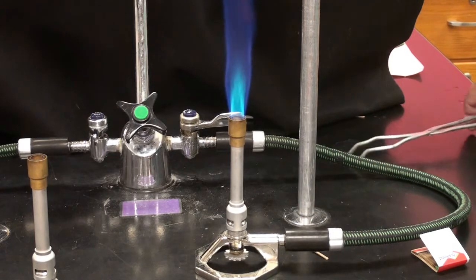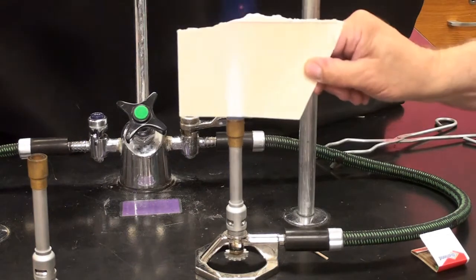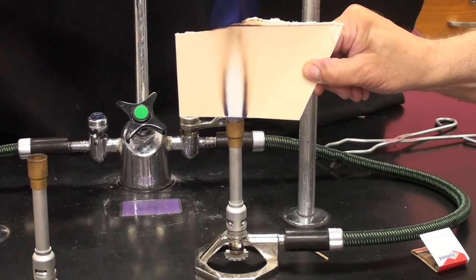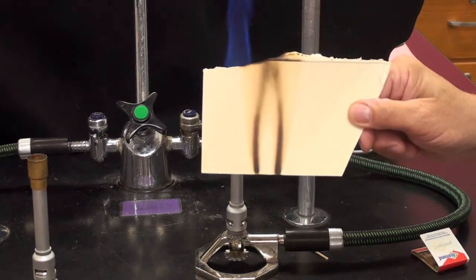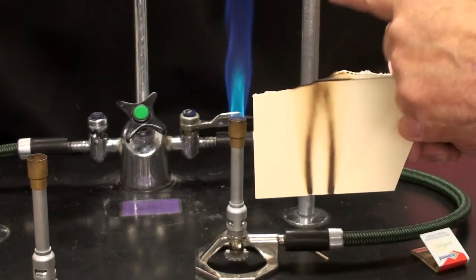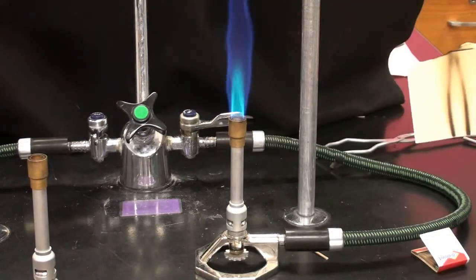Remember that the flame has hot parts and it has cold parts. Here's a piece of cardstock. This gives us sort of an outline of the flame, and we can see that we definitely have a cooler part in the middle and a hotter part above, right? This part above here at the very top, that's where you want to get your real hot part.